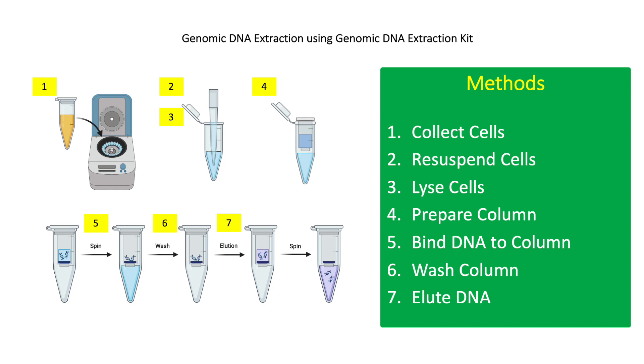For the final step, transfer the column to a new collection tube and add 200 microliters of elution solution. Centrifuge at 6,500 g for 1 minute. This will release the DNA bound in the silica column into the collection tube. Store gDNA at 4, −20, or −80 degrees Celsius.